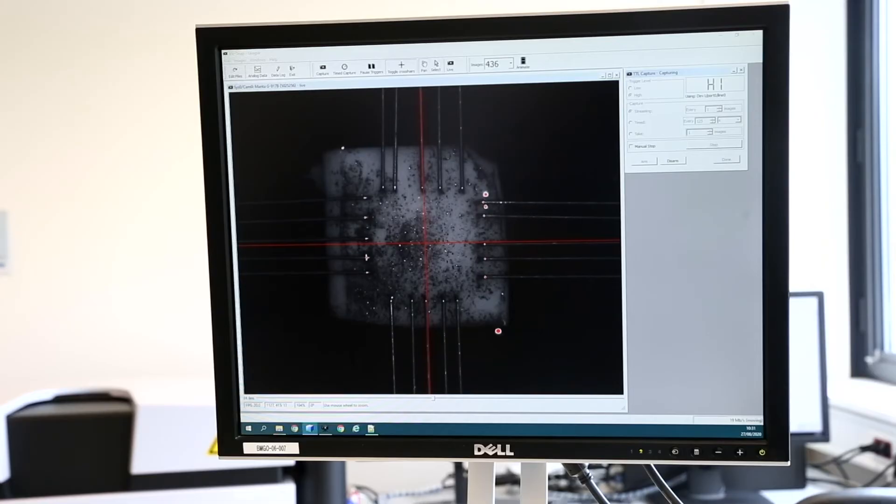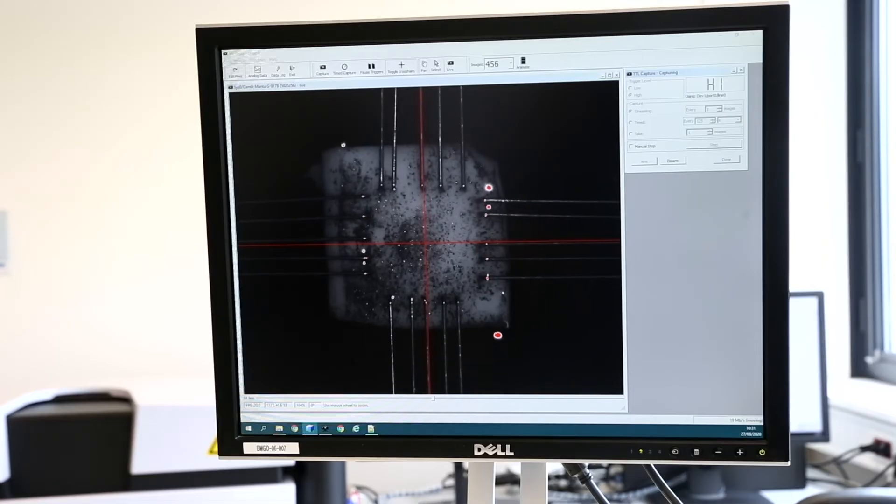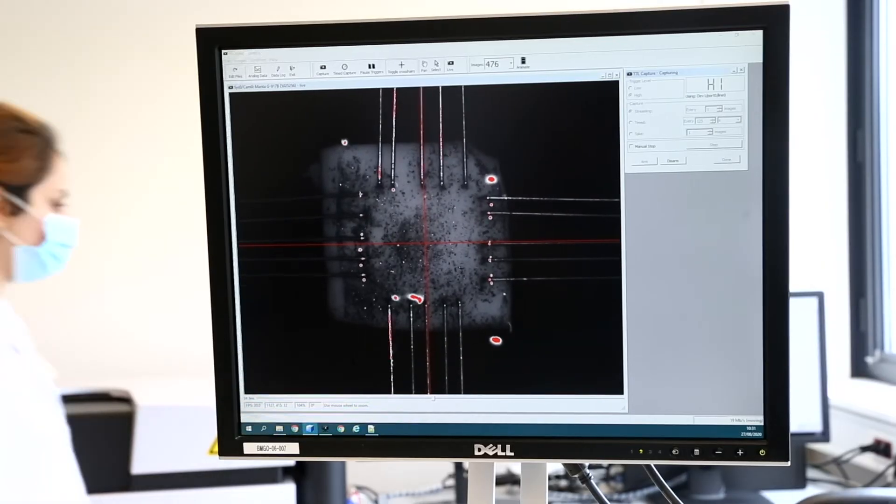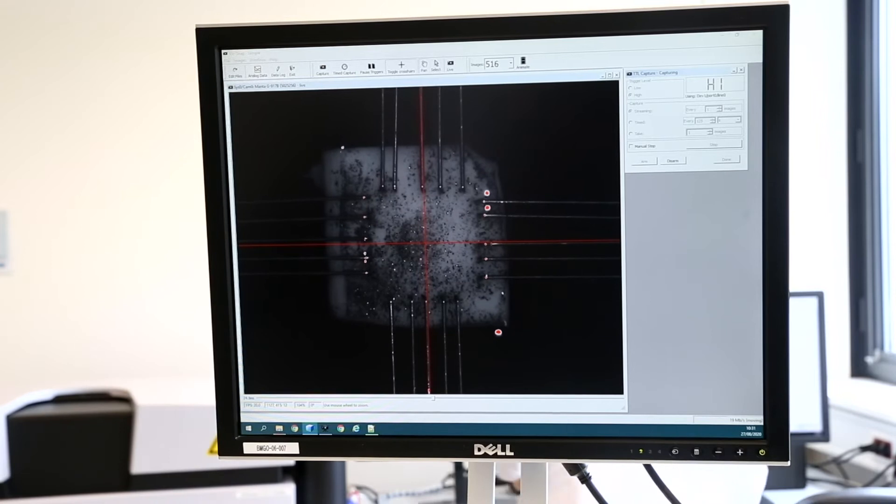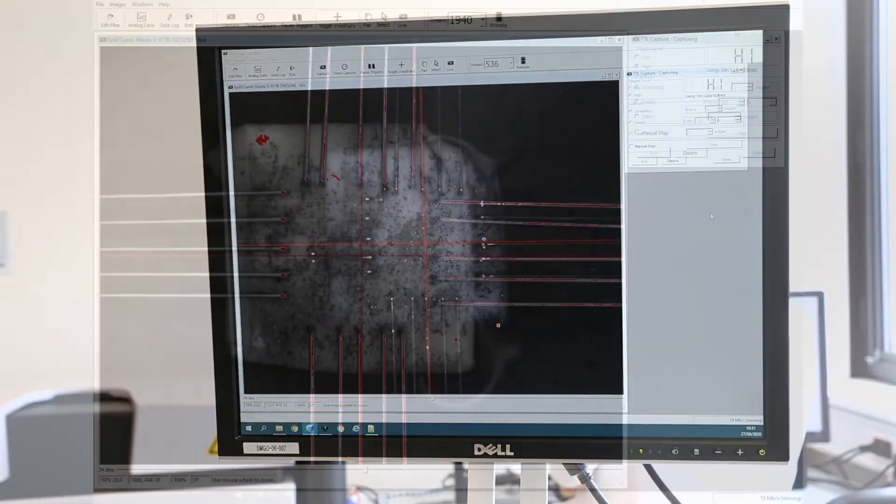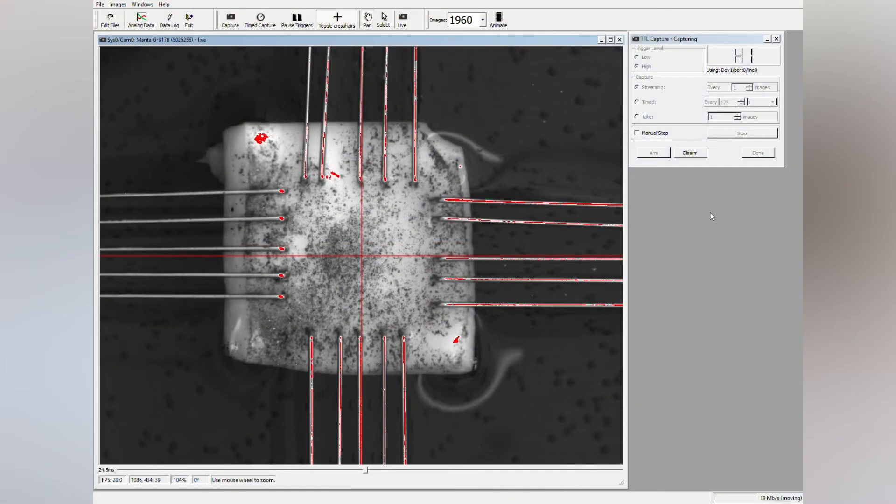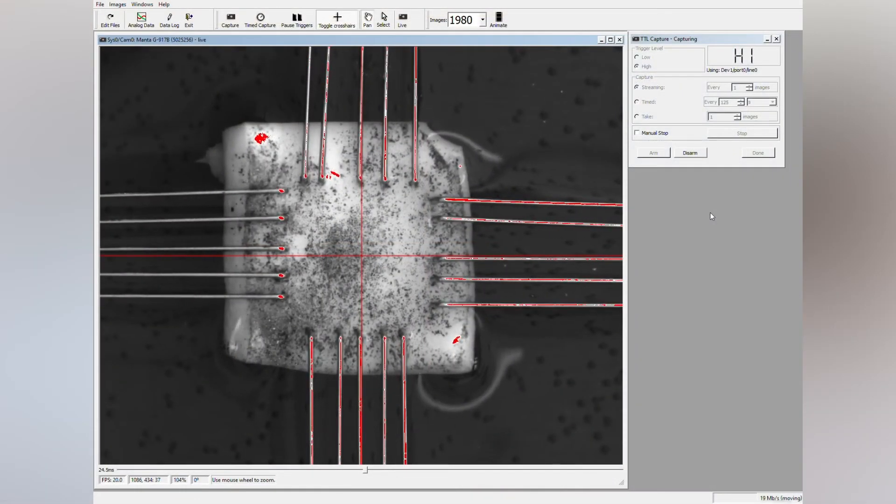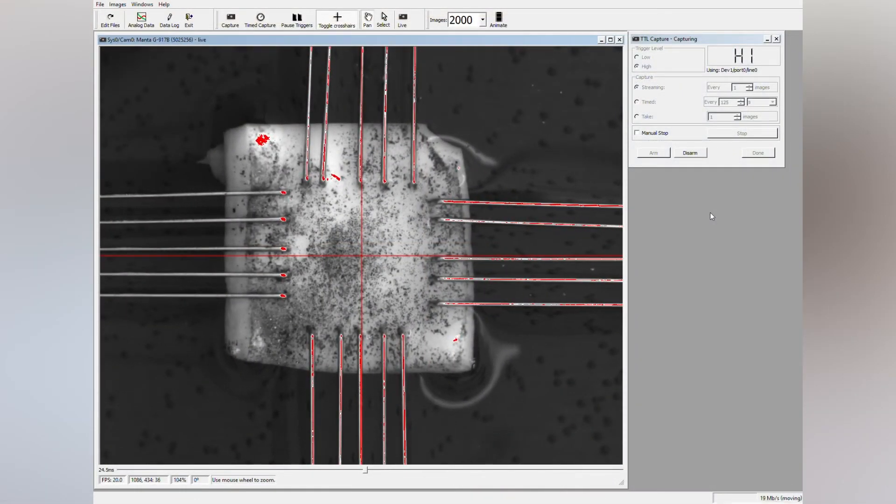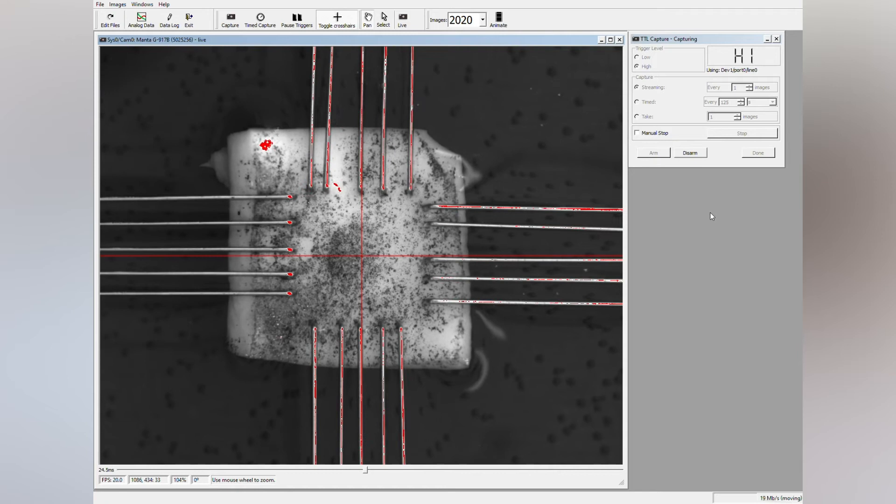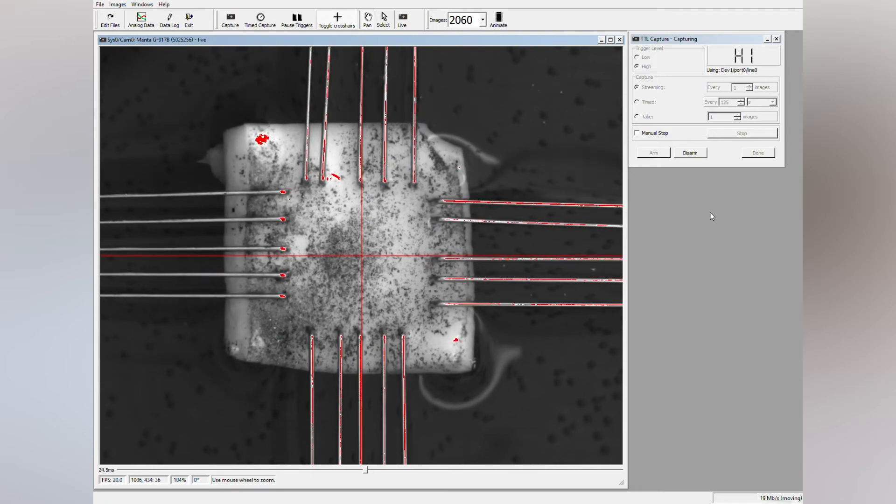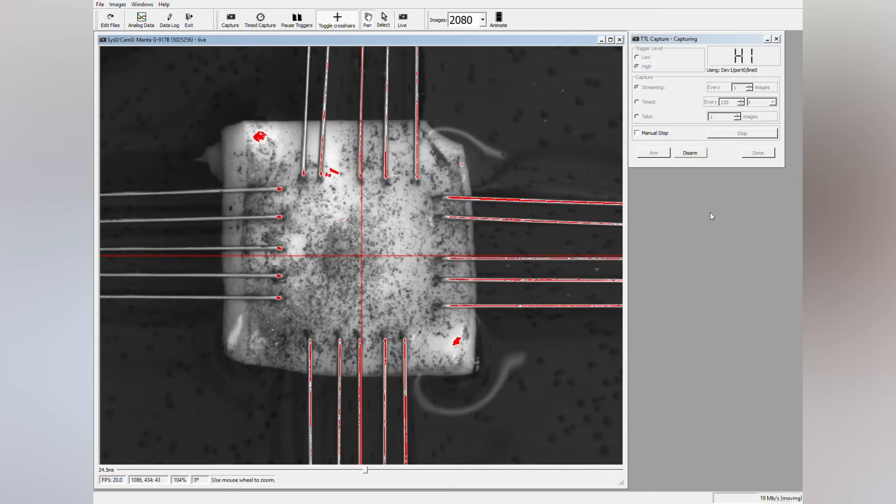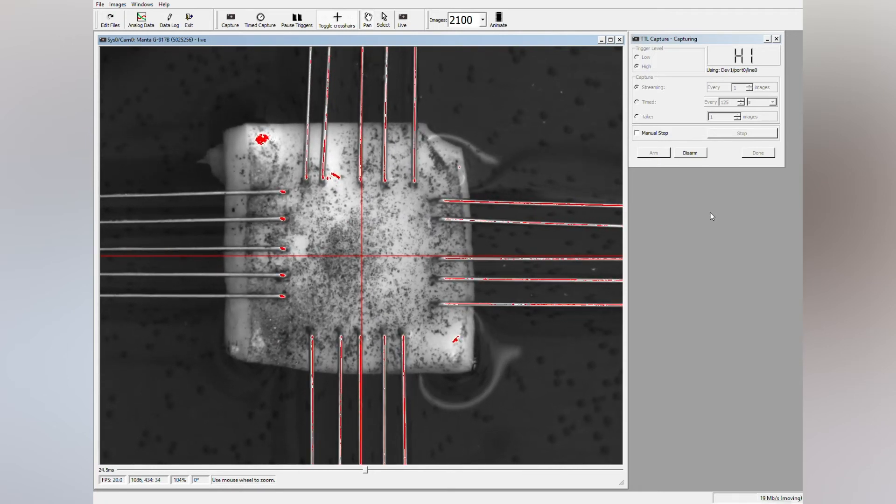During the test, a camera placed perpendicularly to the sample measures the deformation of that sample. This provides more accurate information than using the actuators, because slippage or tear might occur at the mounting site.